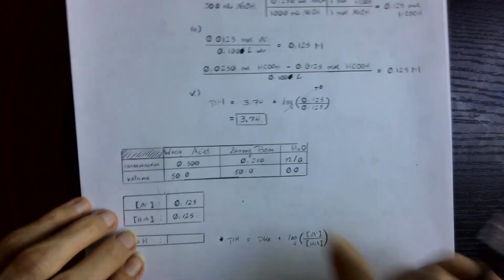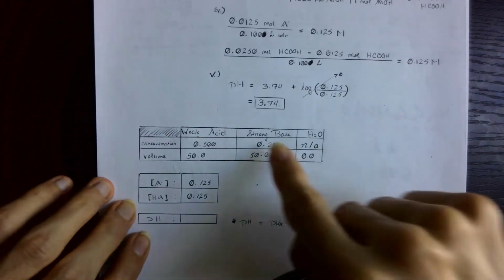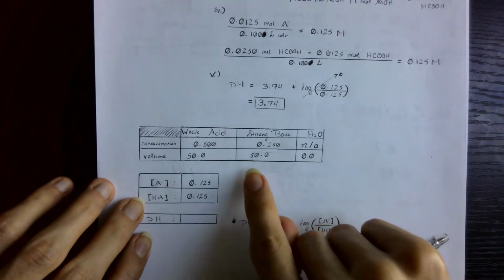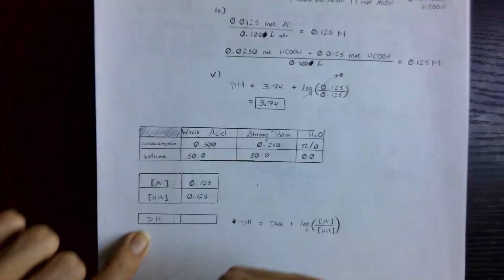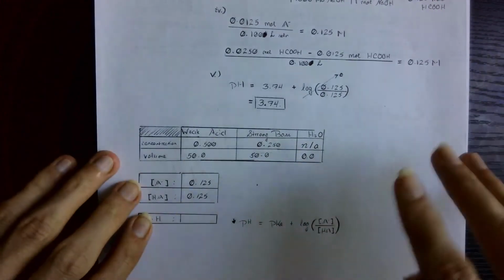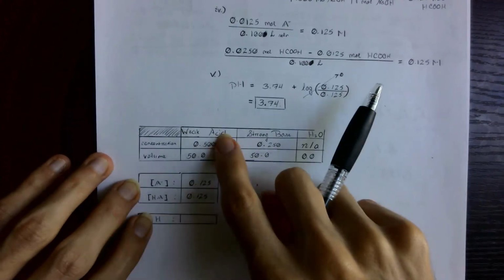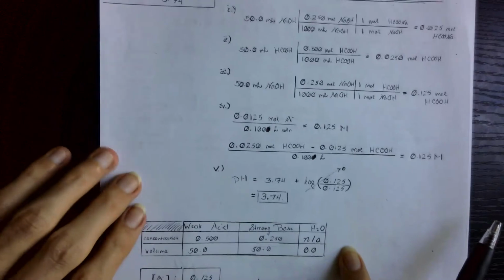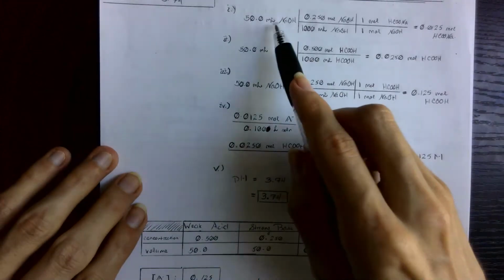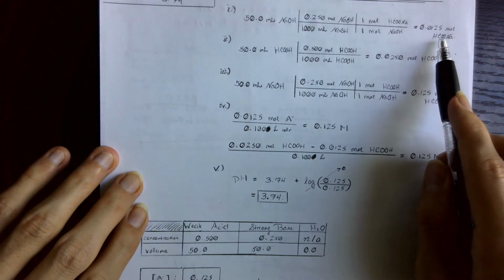But anyway, this is the table, basically. I sketched this is the table for solution 1. You'll have 3 of these on your first spreadsheet. They'll be labeled solution 1, solution 2, solution 3. And for each solution, you've got a table like this where it gives you concentration and amounts of weak acid and strong base.